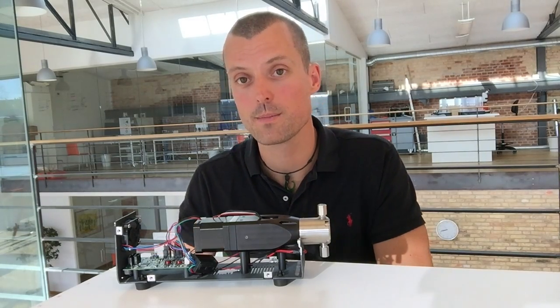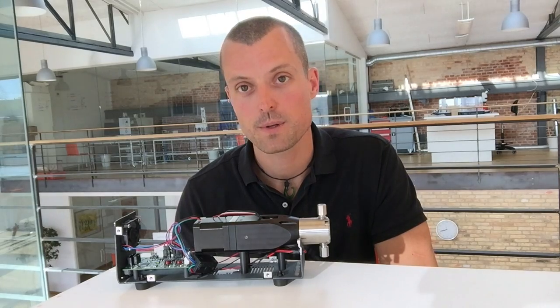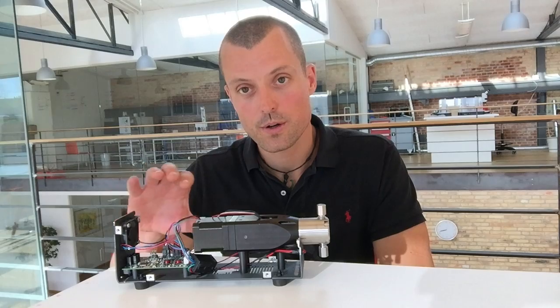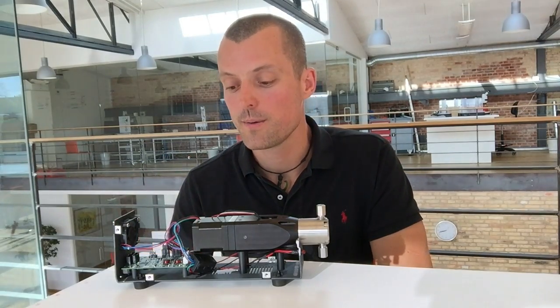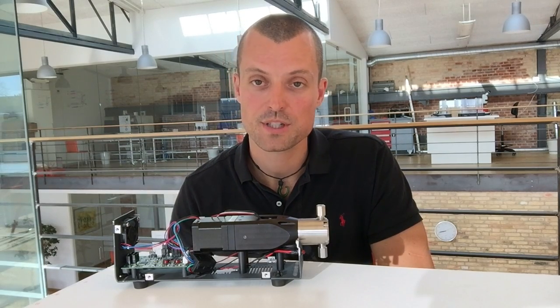We'll also be using a stepper motor with an encoder in order to implement some of the functionality that we need from this pump. We'll not be using any of the housing or the pump electronics that comes with the pump, so we need to be able to implement some custom functionality.